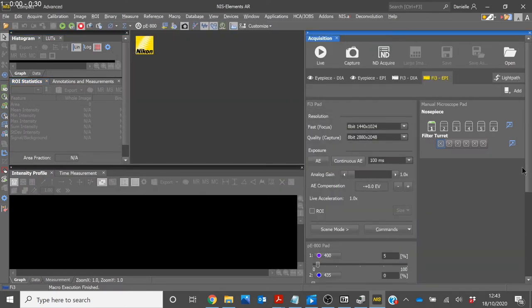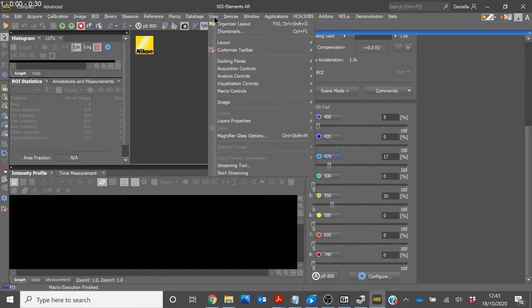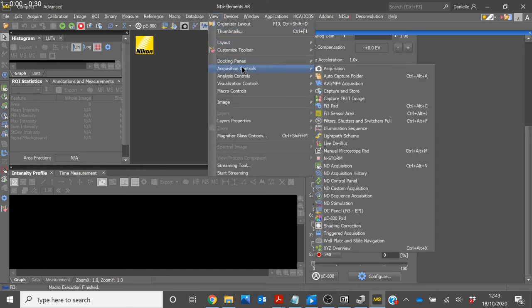If we scroll down, we can see that the PE800 pad has automatically loaded under the Device window. If this does not show up, click View in the Toolbar, select Acquisition Controls, then select PE800 pad.